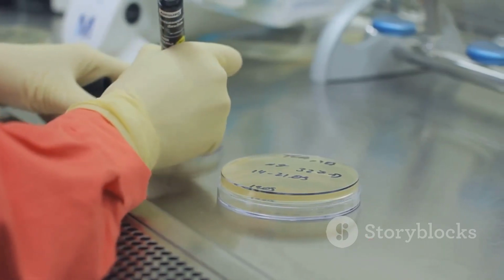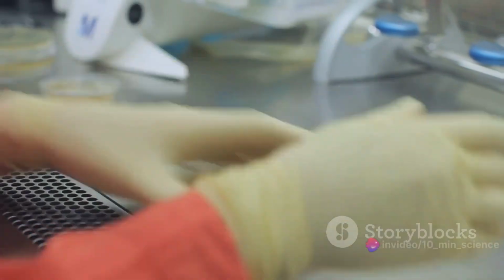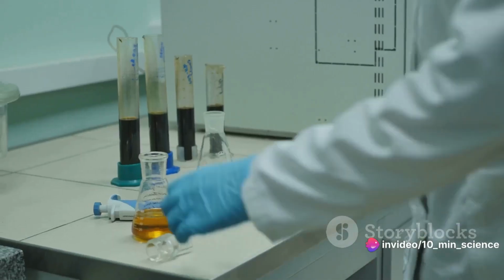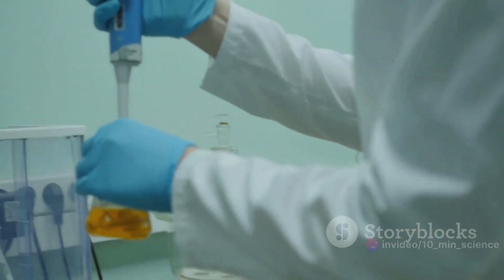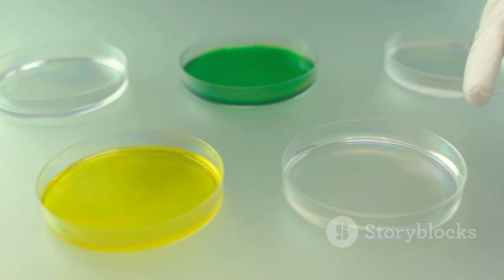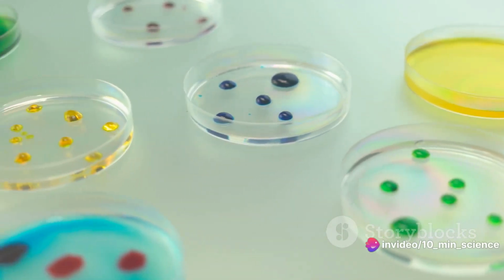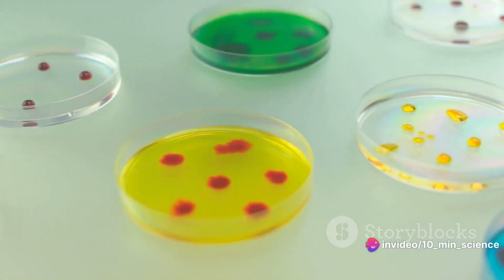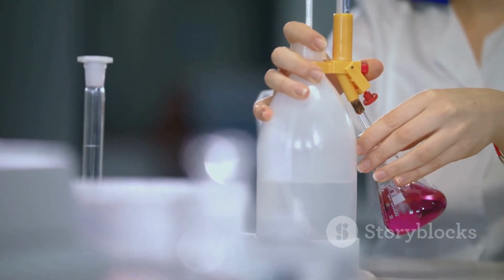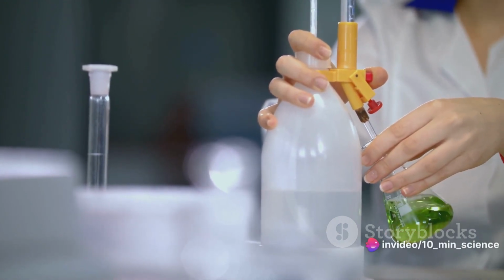Now, let's dive in. Chromatographic reagents are the chemicals used in the process of chromatography. They play several important roles, including acting as the mobile phase or the stationary phase, aiding in the separation of compounds and enhancing the detection and quantification of these compounds. For instance, a reagent like acetonitrile or methanol can act as the mobile phase in a liquid chromatography experiment, helping to carry the sample through the column. But here's the thing, not just any reagent will do. The choice of reagent can significantly impact the results of the chromatography.